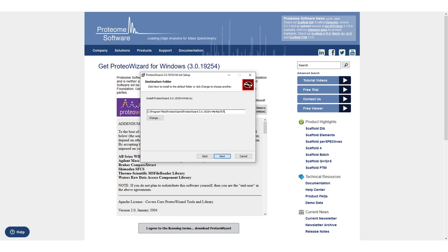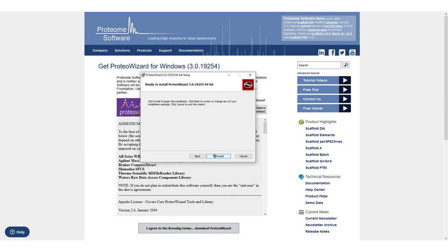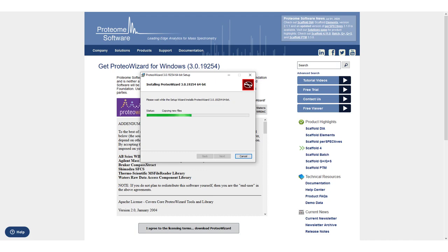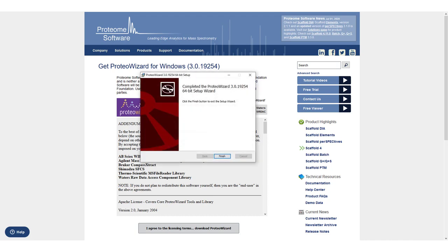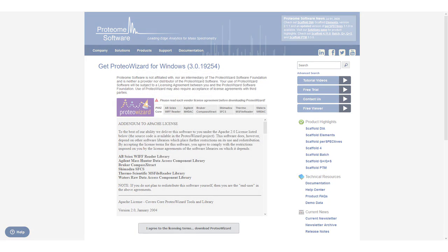Optionally, you can remove the extra characters in the file path. Once ProteoWizard is installed, return to the Scaffold DIA installer.